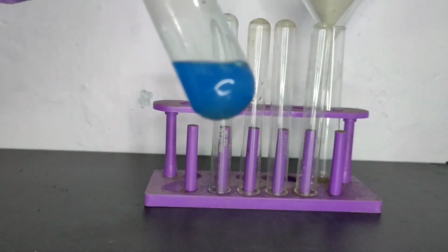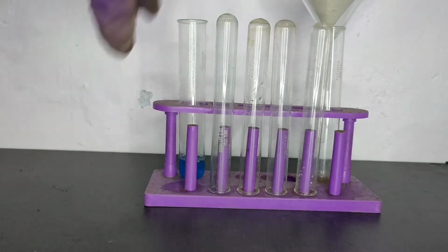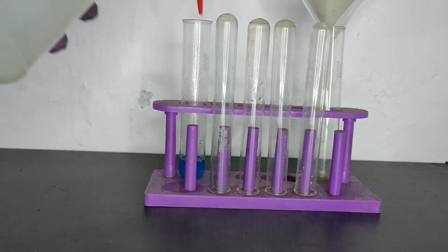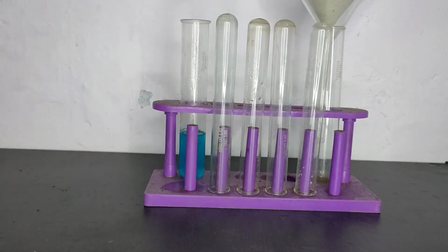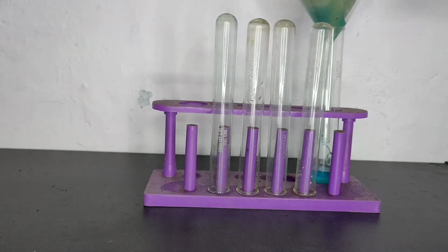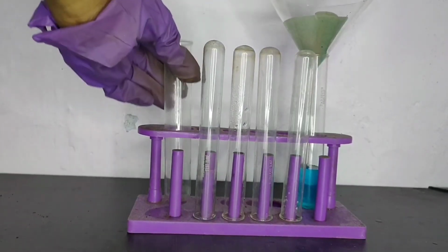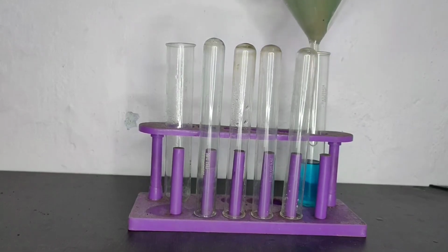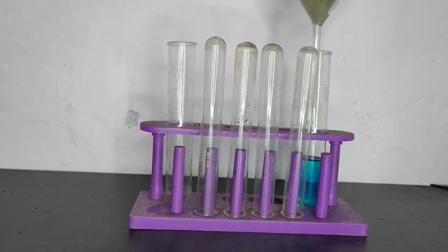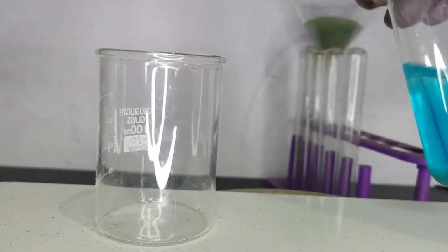So I decided to filter off this solution. Before filtering, I added some distilled water into this solution. And then filtered the solution into another boiling tube. Then I washed the filter paper and the boiling tube with distilled water. Washing steps were repeated twice and thrice to remove all the solution from the filter paper. After all the solution was drained into the boiling tube, the solution was transferred into a small beaker.